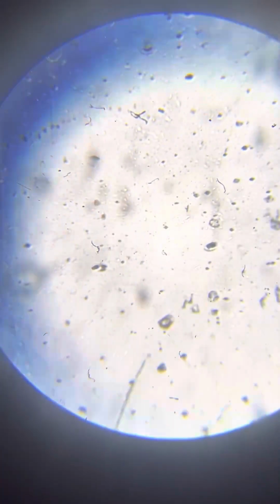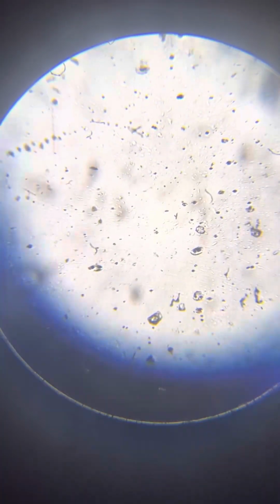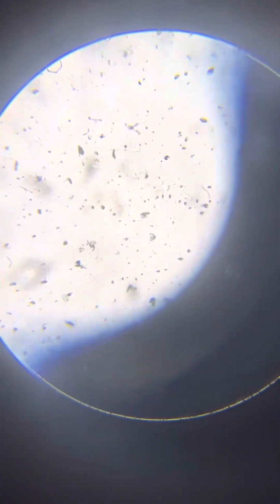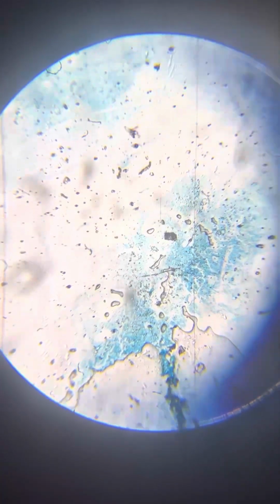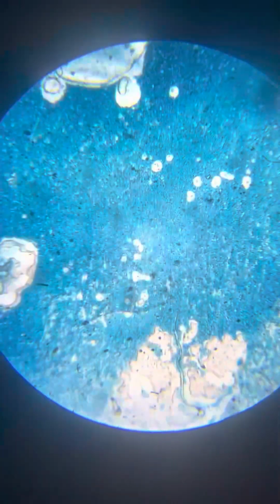I'll put the light to the maximum, I think, or mostly I don't put it up for the 64 magnification. You don't need maximum light, and sometimes it gives you flare, like in the Transformers, the Michael Bay movies. But if the liquid, the medium, is not transparent, sometimes you need maximum light just to penetrate. So we start by seeing this blue stuff, and soon it will be very, very thick.